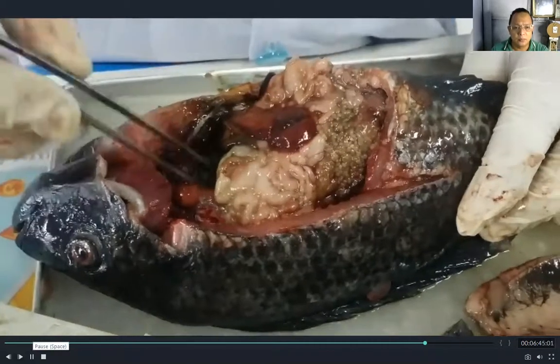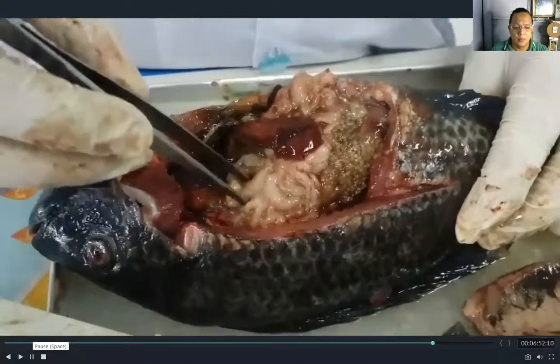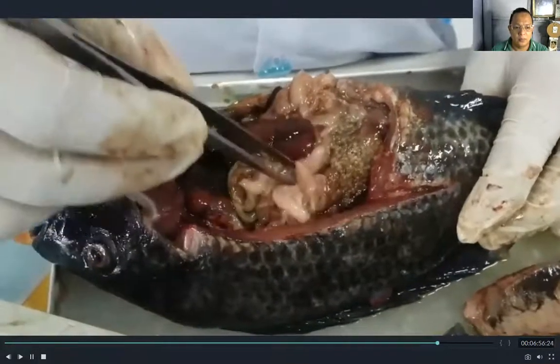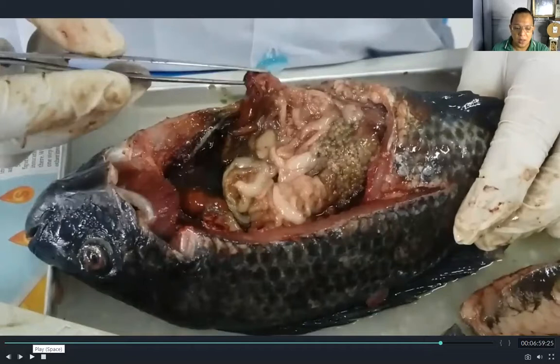It contains a green substance which we call bile — this is the gallbladder. And this is the intestine and the stomach of the tilapia. The stomach and intestines are the primary digestive organs of the fish. The stomach, also known as the gut, stores food while waiting for the intestine to further digest it and absorb nutrients. Piscivorous fishes have very short intestines because their food is easy to digest, while herbivorous fishes require longer intestines for plant fiber that takes longer to digest.